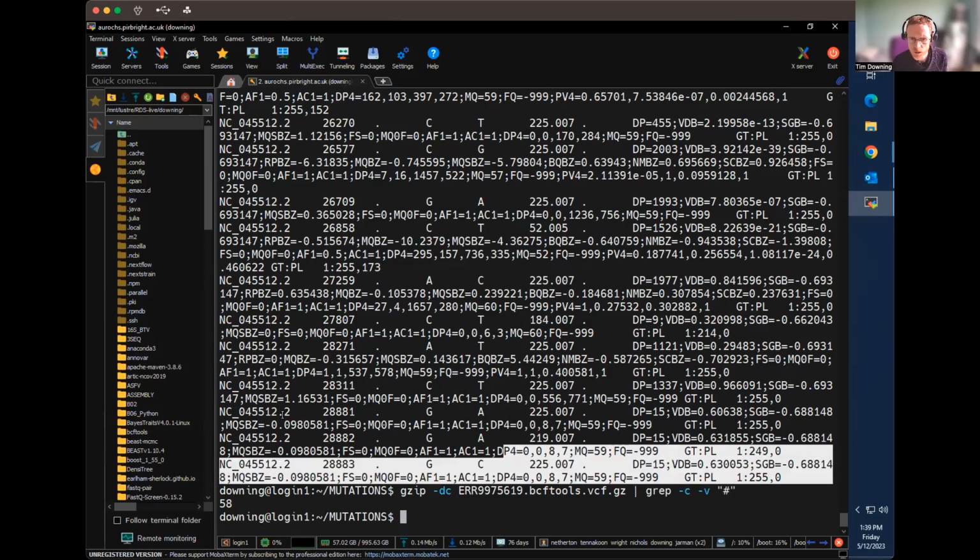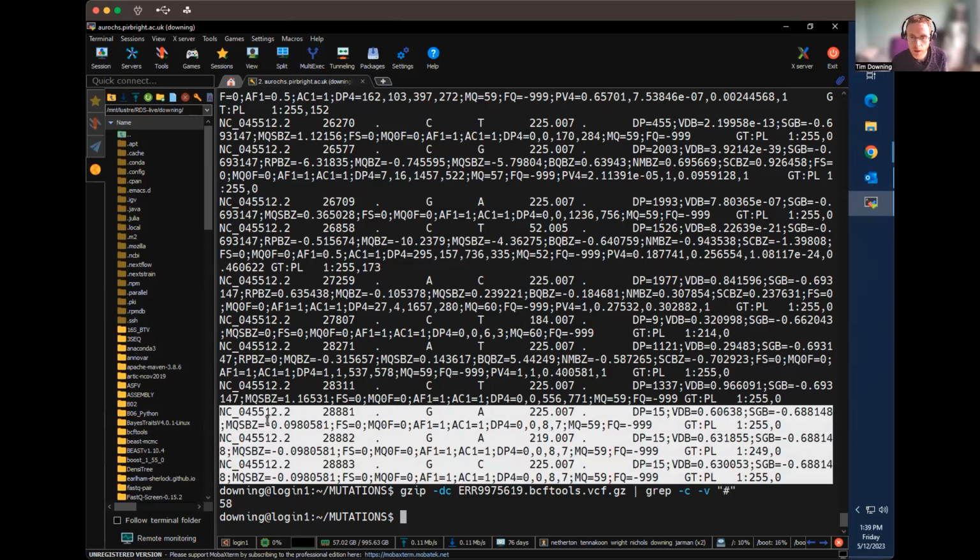You can see even the last 3 here that are all adjacent to each other. That would be surprising if that's real. You see that the depth there is much lower compared to the adjacent regions, and also that it's coming towards the end of the genome, where the resolution of the exact base composition is often more tricky.